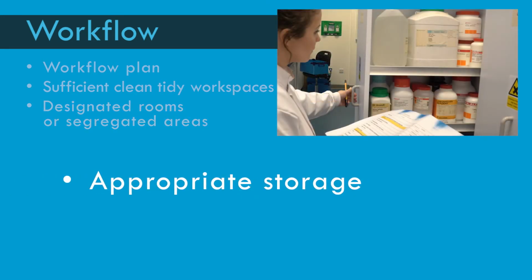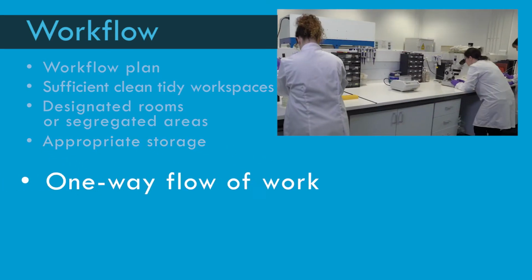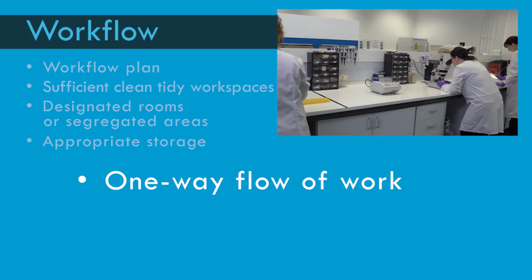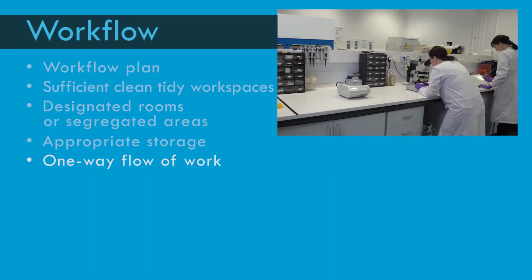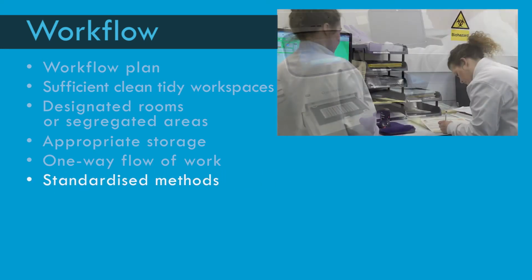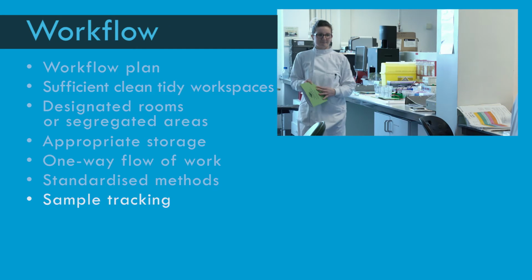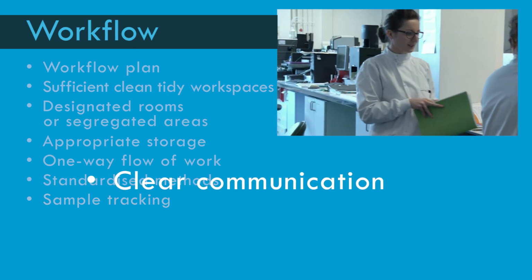Appropriate storage of consumables and equipment. A one-way flow of work to avoid cross-contamination of samples. Standardized methods. Sample tracking. And clear communication between staff.